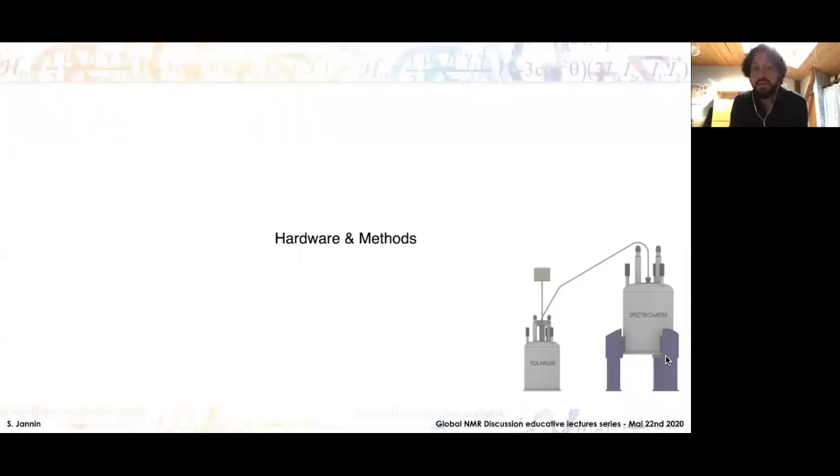But there are many other solvents that have been tested by other groups. The Friedman group, for example, has worked on, I think it was an alcohol, but I don't remember which one. So in principle, it's possible to use other solvents, but water is the one that is mostly used because it's what proteins and humans like.